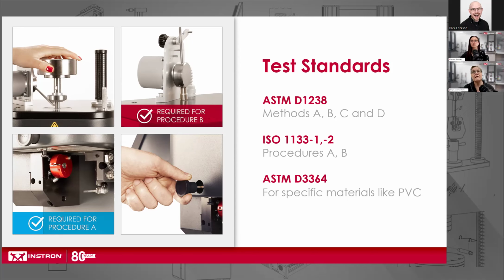Method B for both systems brings in an encoder, and the encoder then watches the travel of the piston, and the test is set up to have the cuts made either when you travel a certain distance, or after a certain time has elapsed, when you've traveled the distance. With the method B systems, you can usually then enter the data, the weight, and it will go off and calculate that data itself.